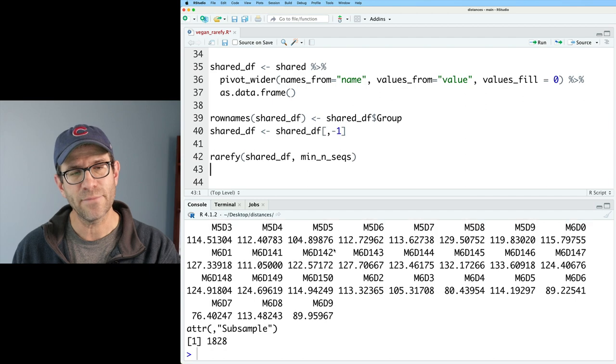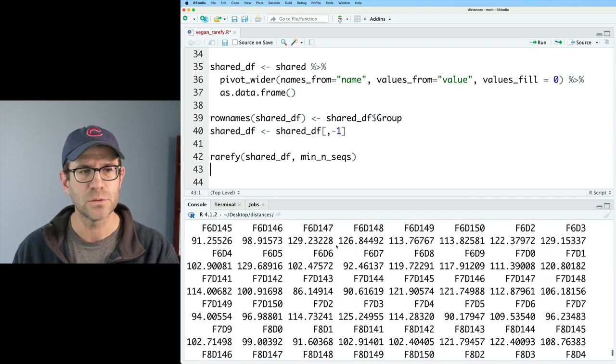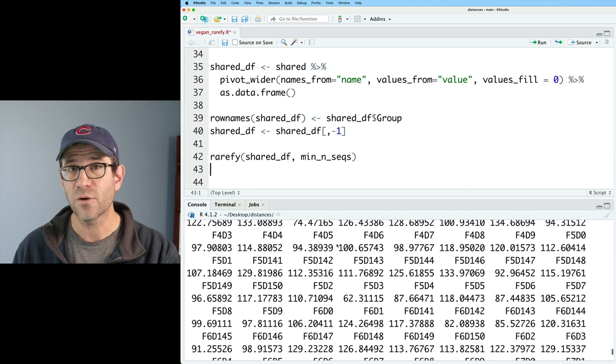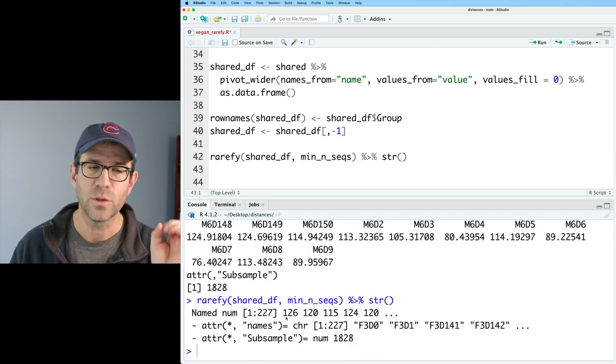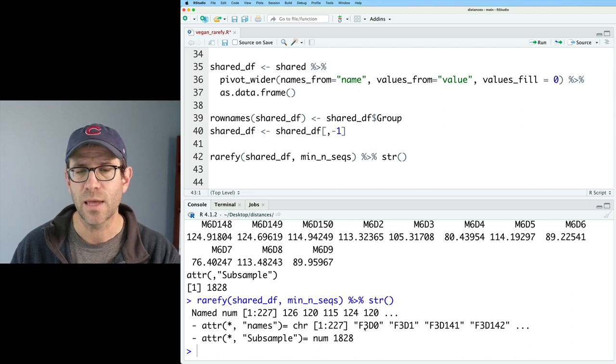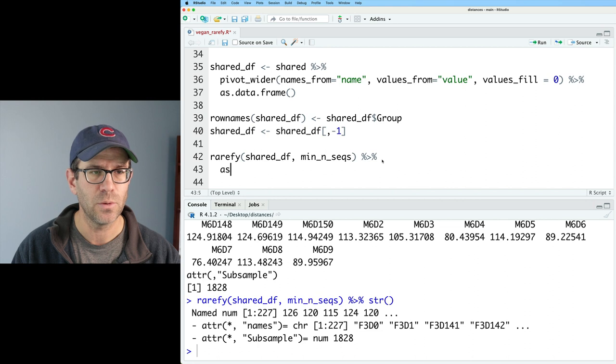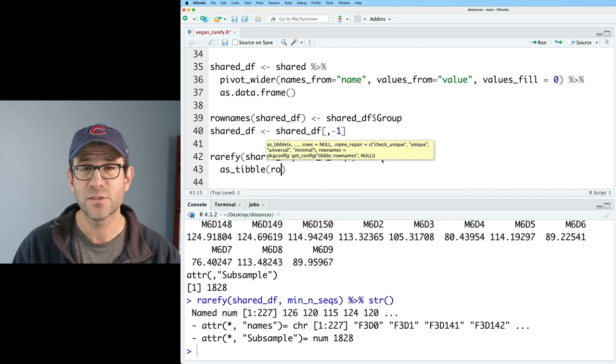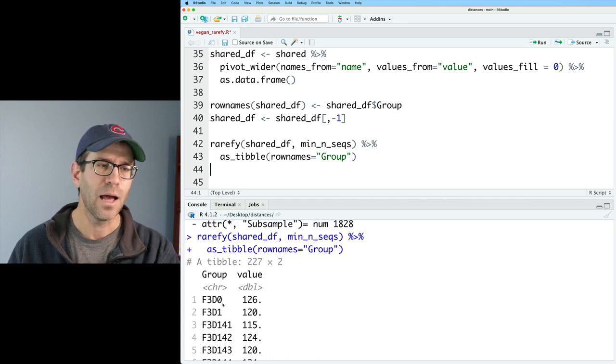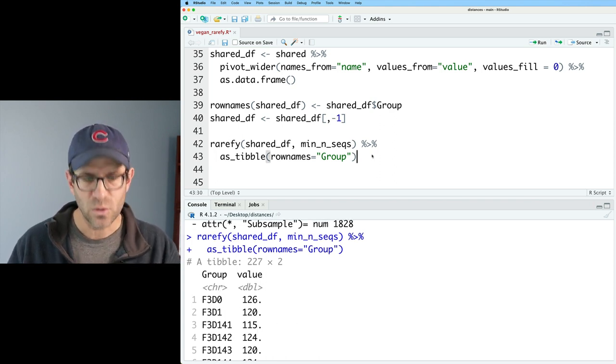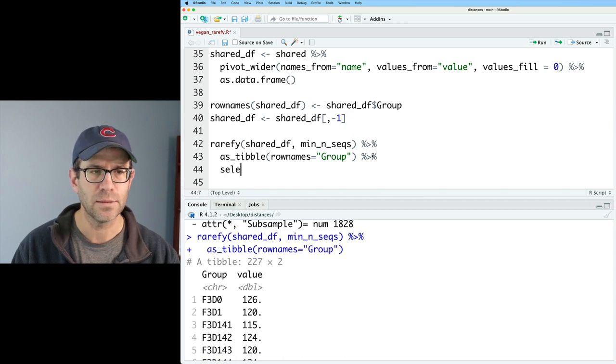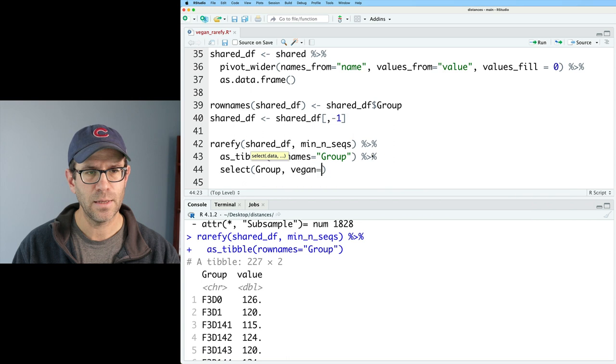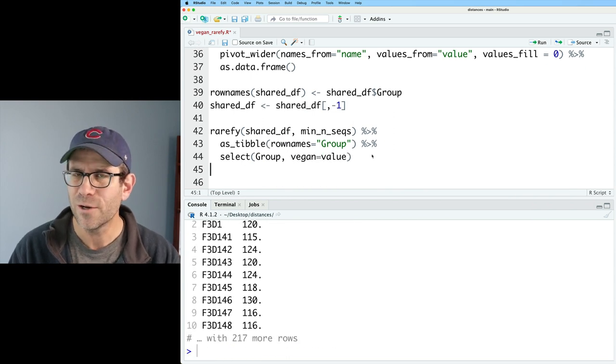All right, so again, we have seen now how we can get out a vector of values that are rarefied to a specific number of observations. It's a named vector with 227 values, each value has a separate name. Well, I can also pipe this into as_tibble. And I could say rownames equals group. And now I get a tibble, where I've got a group column and the value.